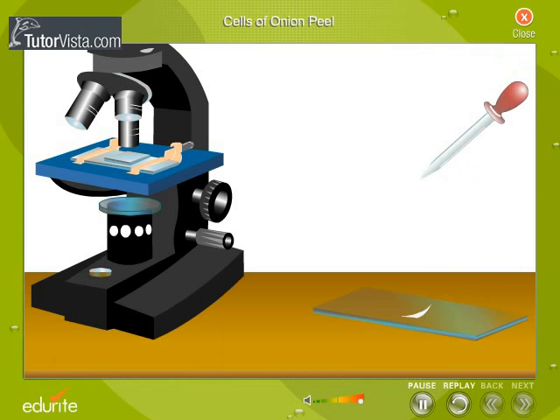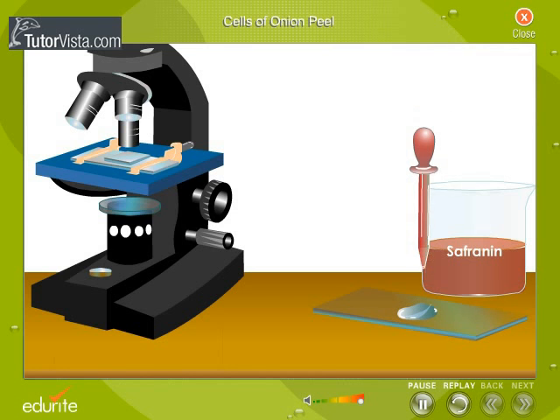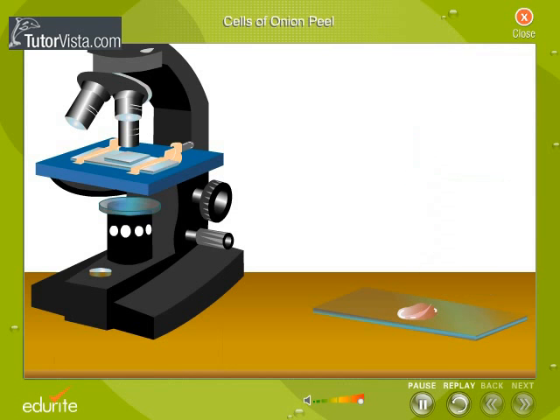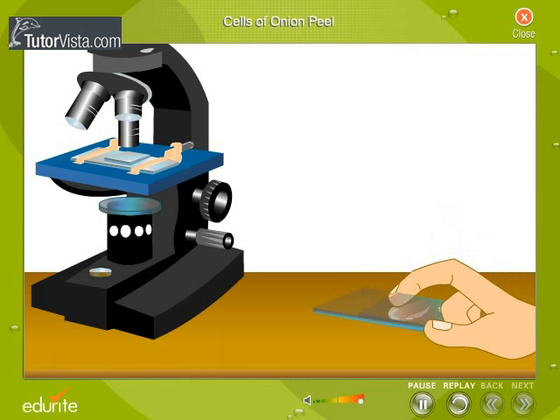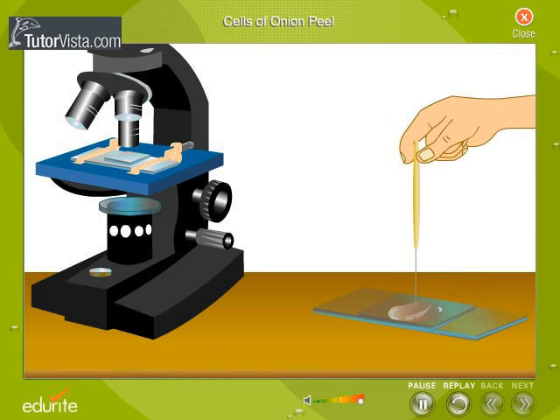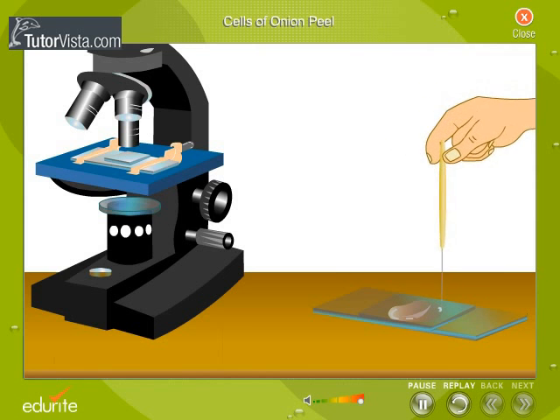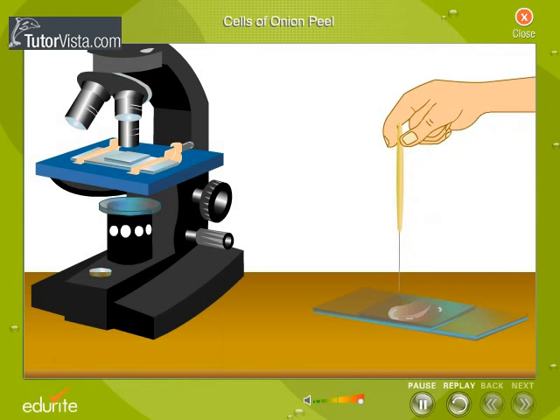Put a drop of water on it and then add a drop of saffranin. Cover it with a cover slip. Tap the cover slip with a needle gently to remove any air bubbles.